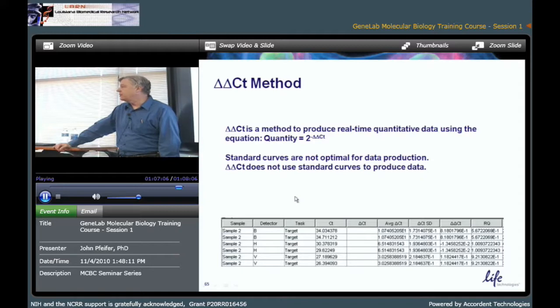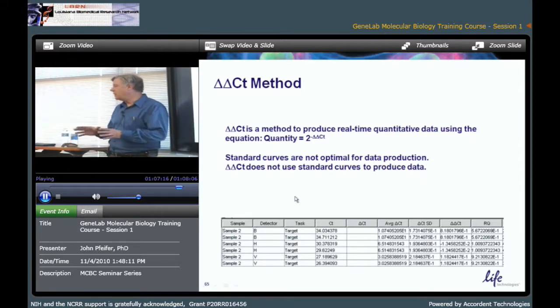And I have seen exceptions. For example, there's an instrument that uses glass capillaries. I've seen some issues there. But most of them use plastic plates, and I think that's good. A polypropylene plate is usually a standard thing people use in PCR.